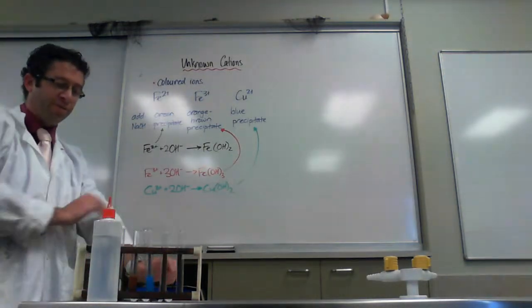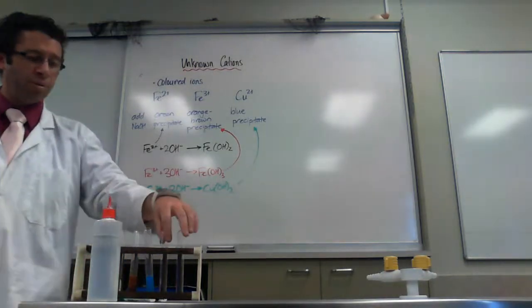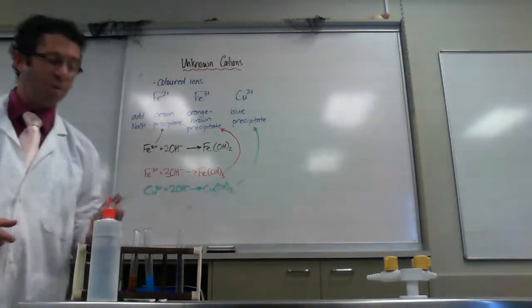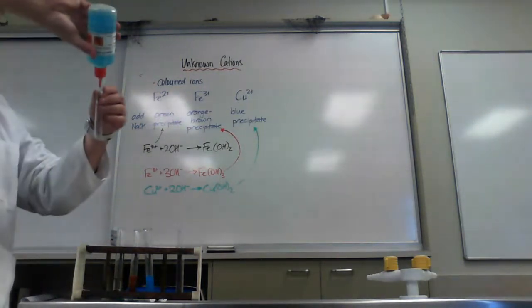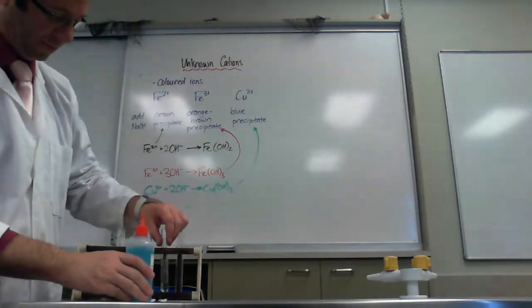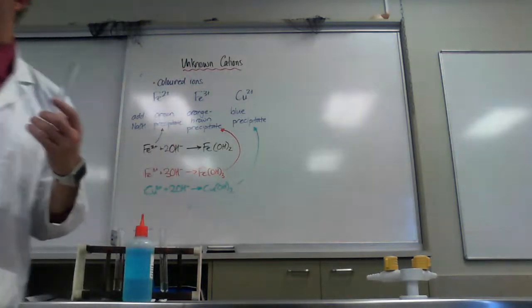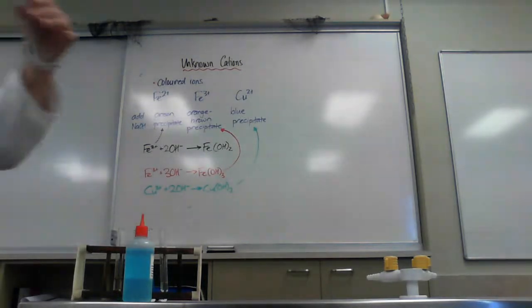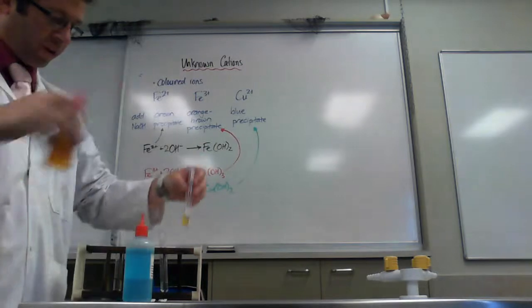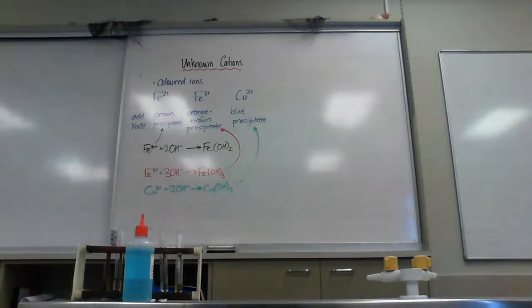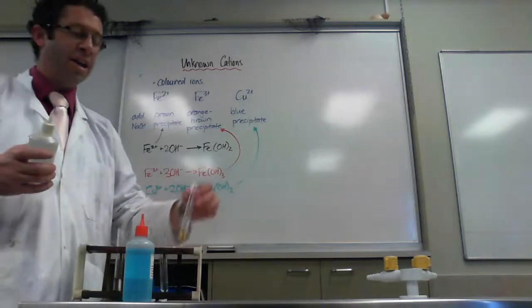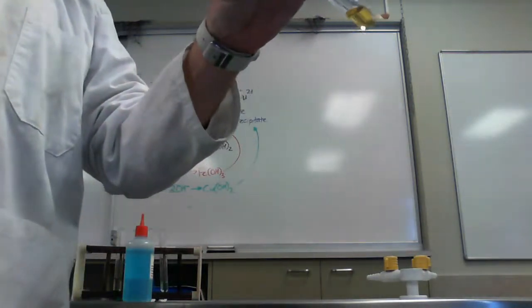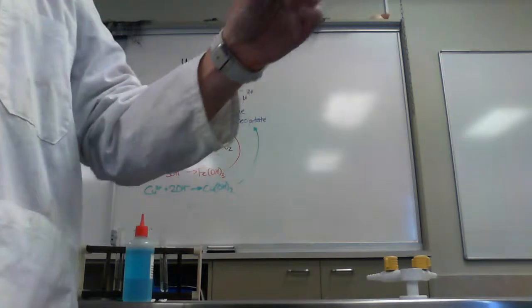So we've got a chemical equation for each of those. Now there is actually a way that we can further confirm these. I'm going to need new samples of both the Fe2+ and the copper to show you what I mean here. So here I've got some copper again. And this one I'm going to put some Iron 3, in this case nitrate. Now Iron 3 is quite a cool chemical because when I add potassium thiocyanate to it, which again the potassium is a spectator, it's the SCN negative ion that matters. Check out the color that we get from this one. It's gone a blood red color.